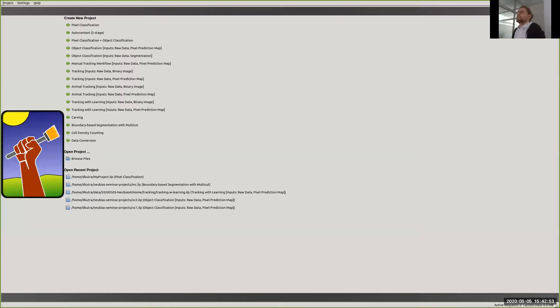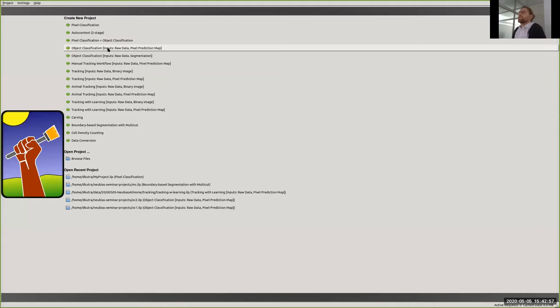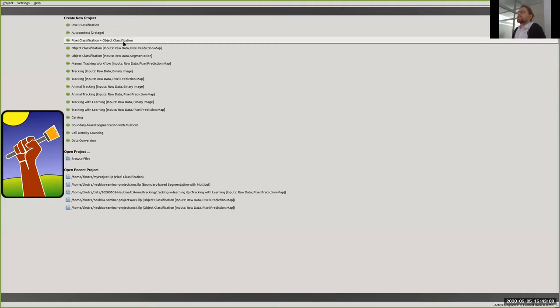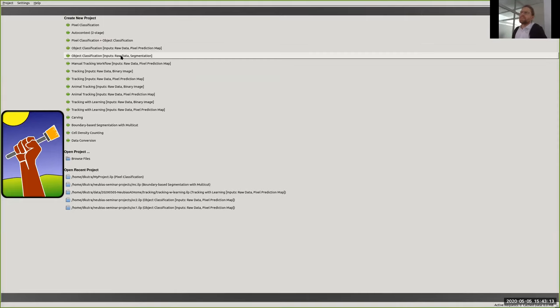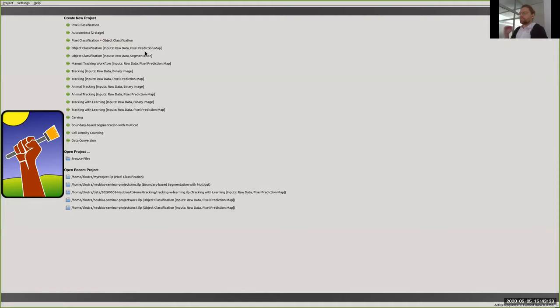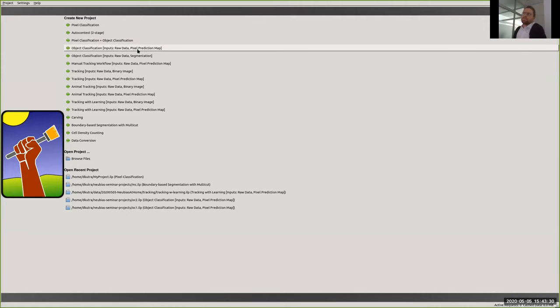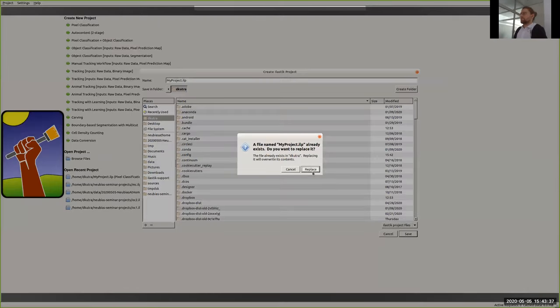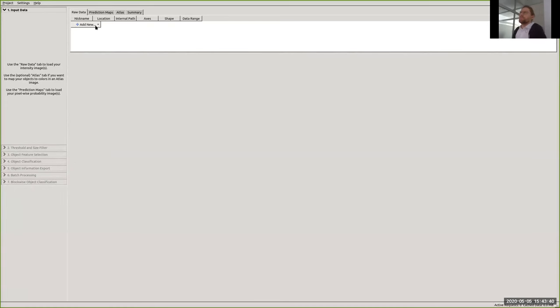Let me start up Elastic again and show you how object classification works in practice. In the setup window, object classification appears three times. Pixel classification plus object classification is only for demo purposes — not for serious work. The other two object classification flavors differ in the type of input you give: either a segmentation directly, where each pixel has a hard decision, or a pixel prediction map that you can produce in pixel classification. I already produced a pixel prediction map with this alphabet soup example.